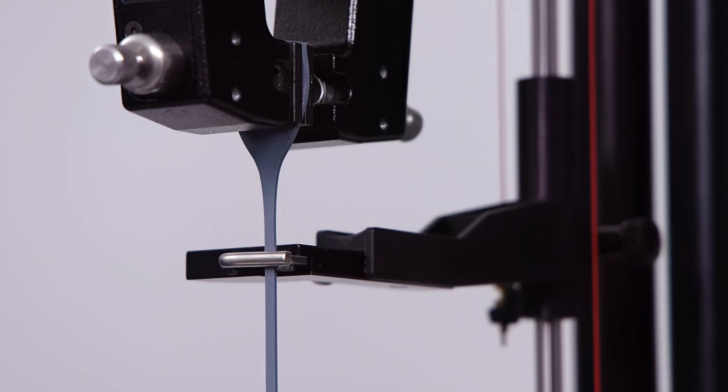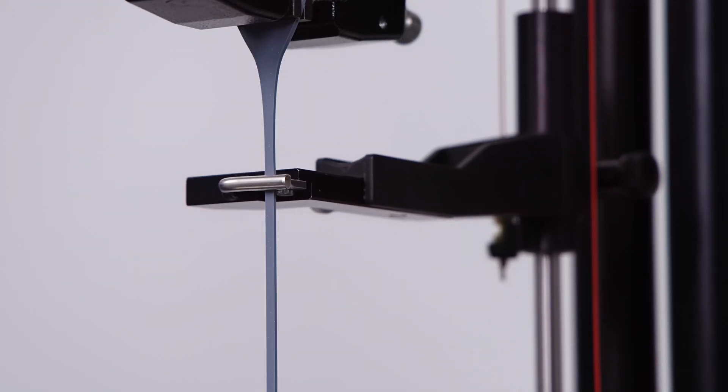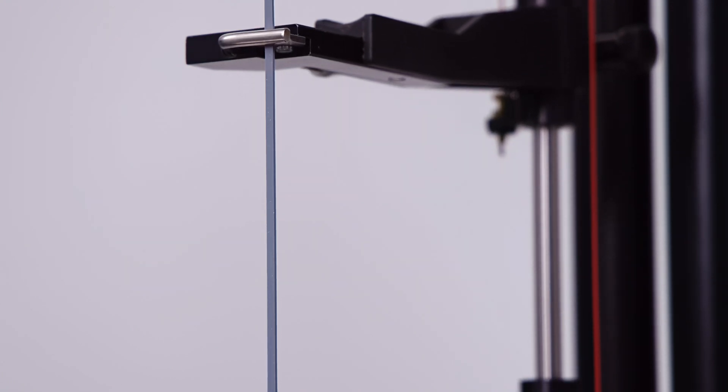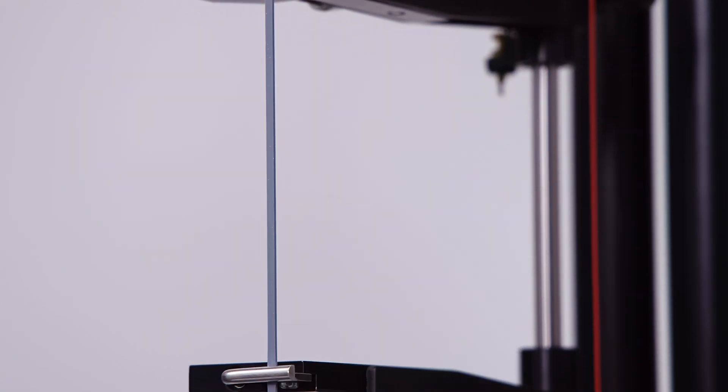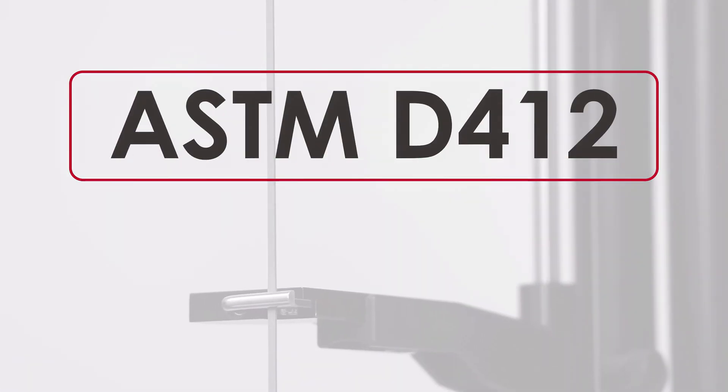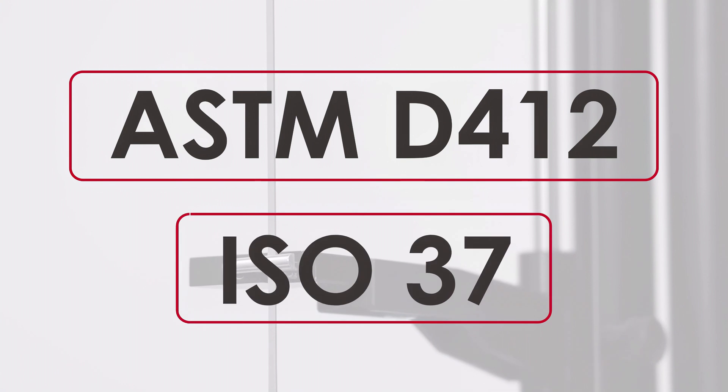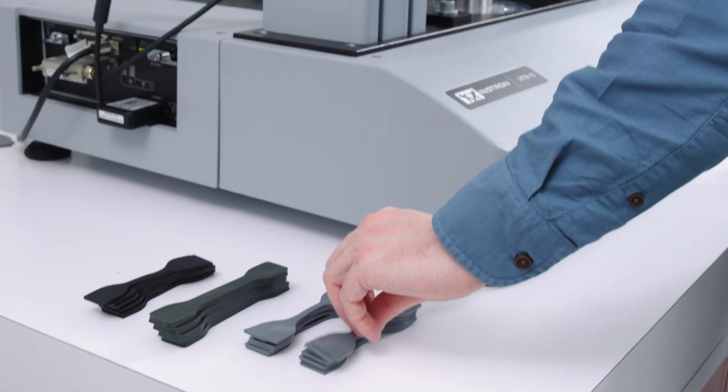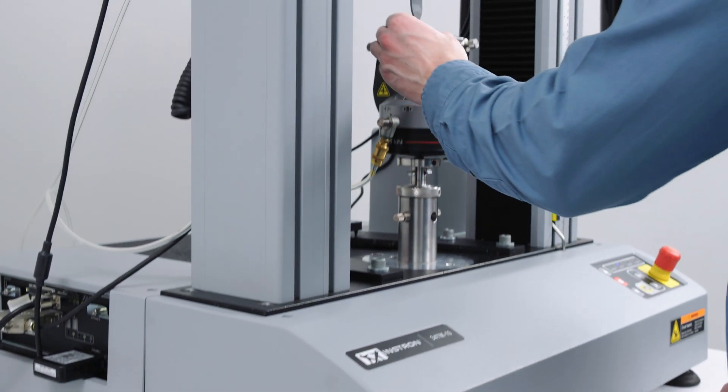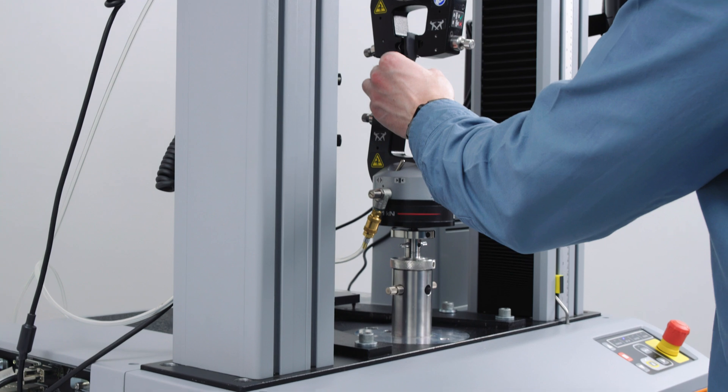The Long Travel Extensometer delivers repeatable results and meets common industry standards such as ASTM D412 and ISO 37. It also excels in high-throughput quality control environments.